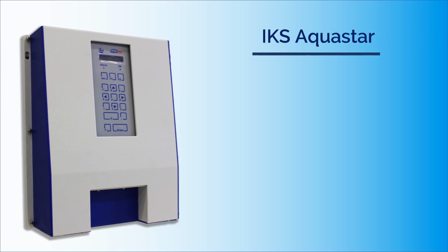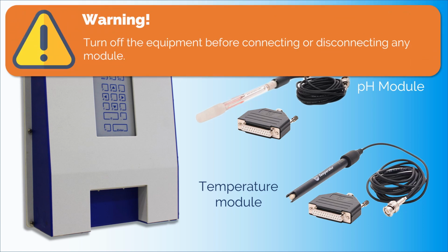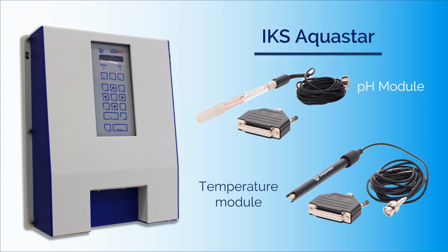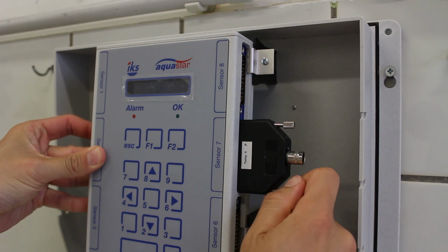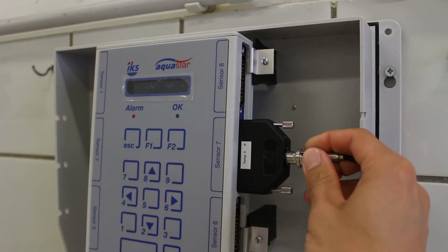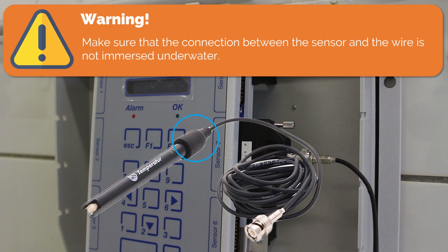Now that you're familiar with the parts of IKS Aquastar, let's proceed to connecting the modules. Important reminder: turn off the equipment before connecting or disconnecting any module to avoid damage. Each measurement module comprises a sensor and its appropriate converter. These two are separate for pH, temperature, redox, and oxygen sensors. Water level and conductivity sensors are firmly connected to the converter. First, connect the converter to IKS and tighten the 2 screws. Then, connect the appropriate sensor to the converter. Do the same for the other sensor. Warning: always make sure that the connection between the sensors and the wire is not immersed in the water.